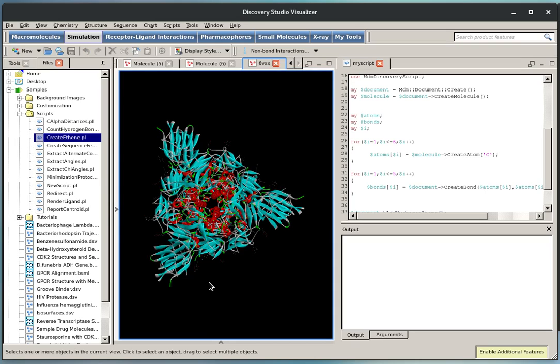Those of you who haven't done biological sciences, just don't be perturbed by the ribbon display of this. This is a macromolecule, it is composed of atoms, and one of your tasks will be to show the atoms of this. So don't forget to copy and paste into your document where appropriate.